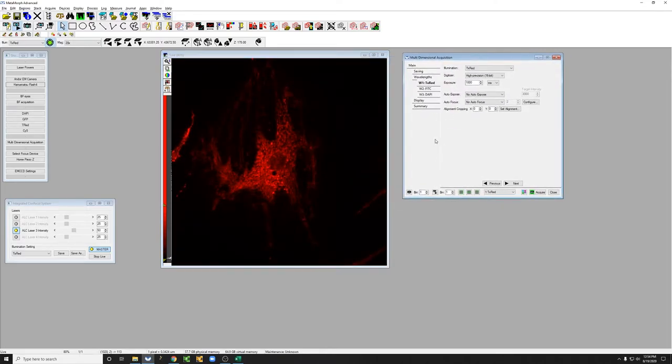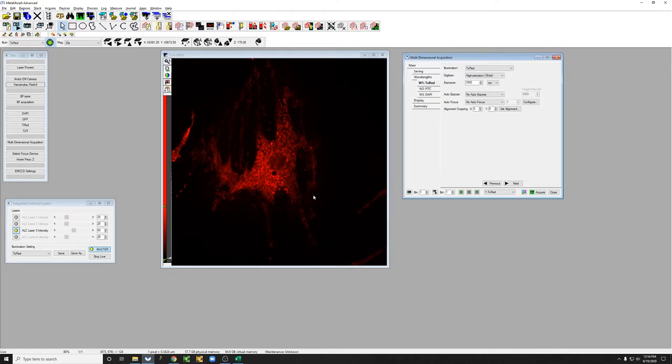Okay, so there we have a sample. What else do we need to pay attention to as we're optimizing our settings?